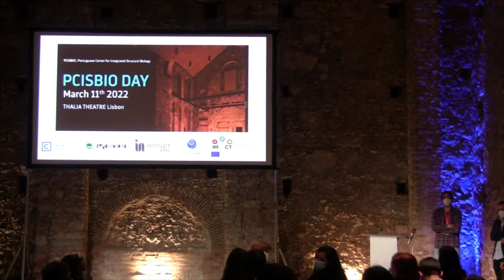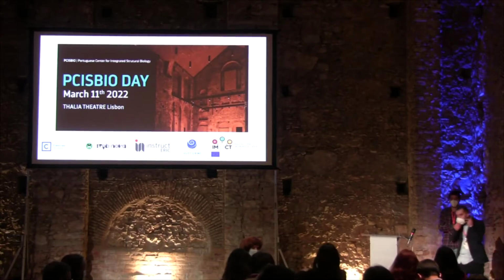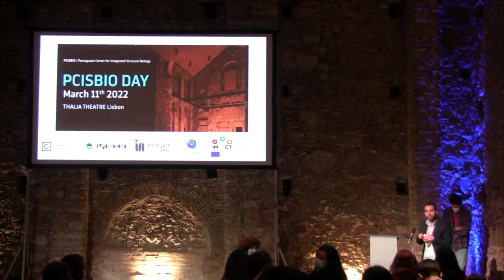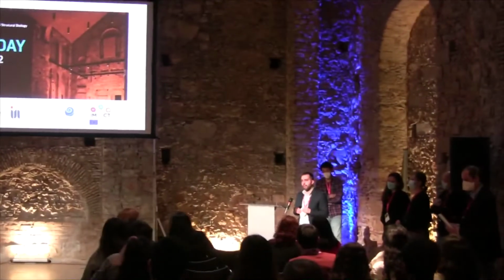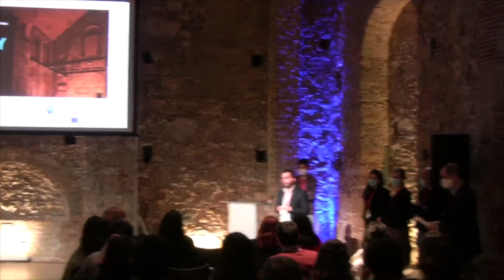Yes. My question is to Tiago also. I would like you to explore a little bit more how you evaluated the interaction between the tetraplex and the nucleotide by fluorescence, and if these outcomes are comparable to the ones that you get by ITC.